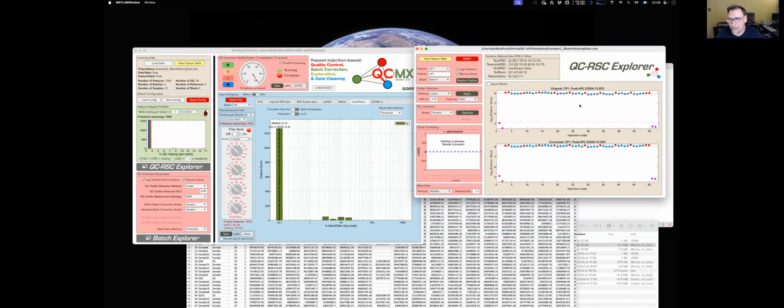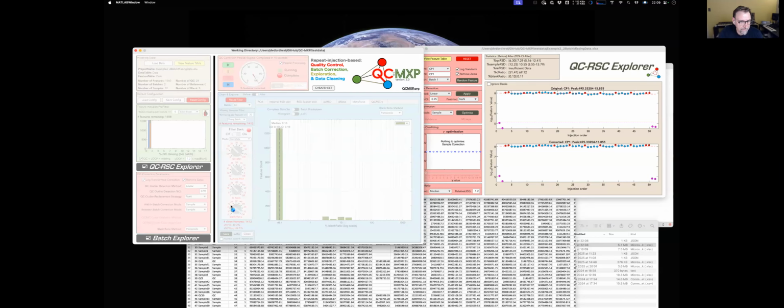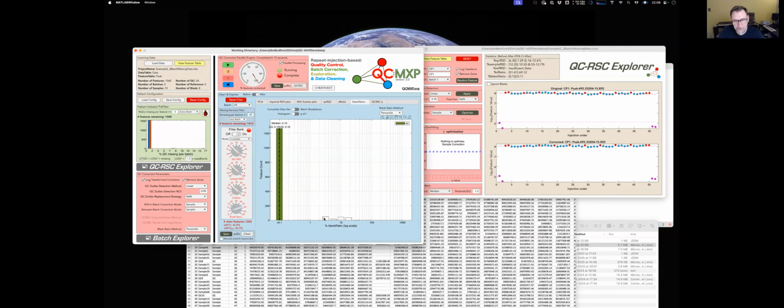So, sorry, it's actually not the QC, it's the total sample. So what this is basically saying is that, from this figure here, all but that few number, let's see how many that is. So there's about 200 features where there's more than 1% of the samples below the blank. Therefore, most of the signal is above the blank. Therefore, I say that's fine. As long as you've got a good D ratio and most of your samples are above the blank, then we're good. That's what I like.